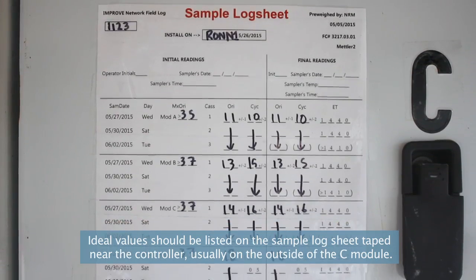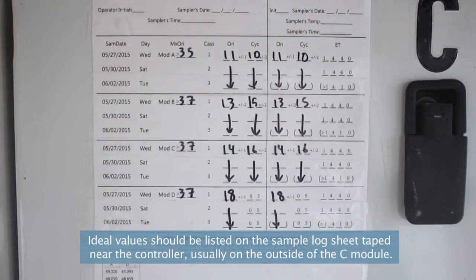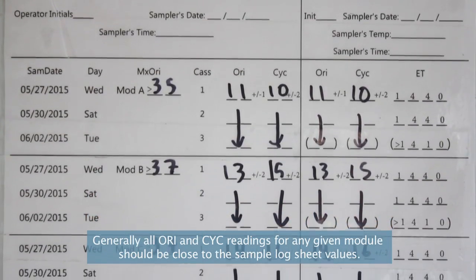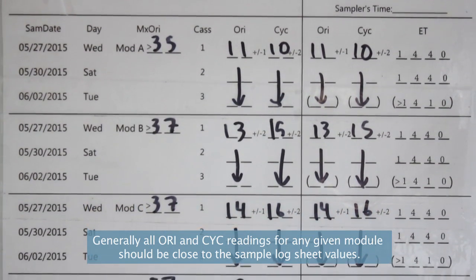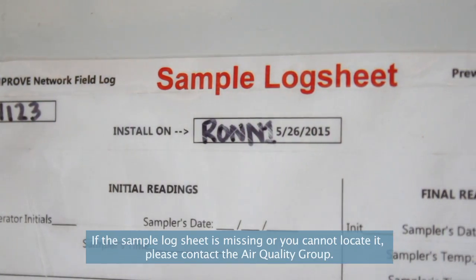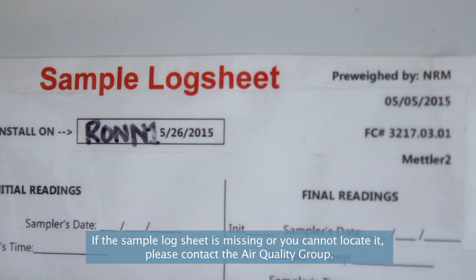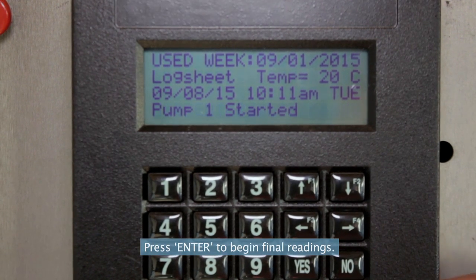Ideal values should be listed on the sample log sheet taped near the controller, usually on the outside of the C module. Generally, all ORI and CYC readings for any given module should be close to the sample log sheet values. If the sample log sheet is missing or you cannot locate it, please contact the air quality group. Press Enter to begin final readings.